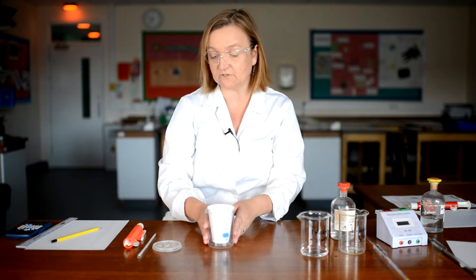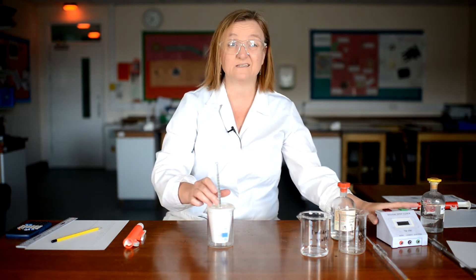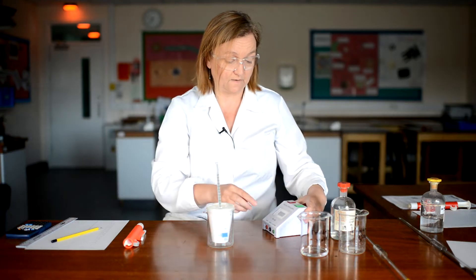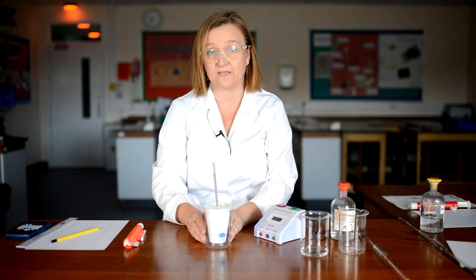But before I add the sulphuric acid and start the neutralisation reaction, I want to get a measurement of the temperature of the solution to start with. So I pop my lid on and put my thermometer on and then start my stop clock.